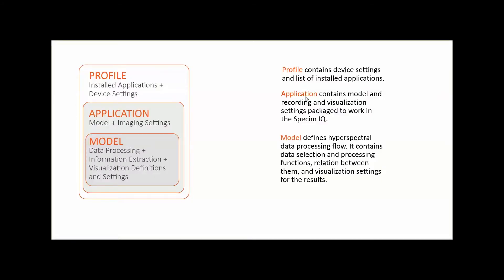As we can see, the model is presented inside the application and the application again inside the profile.